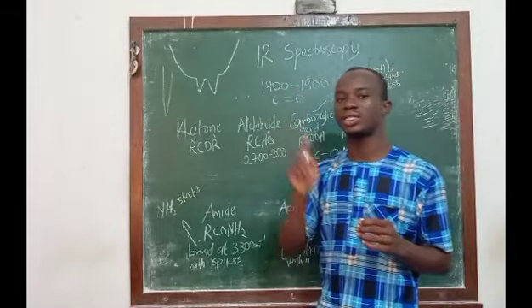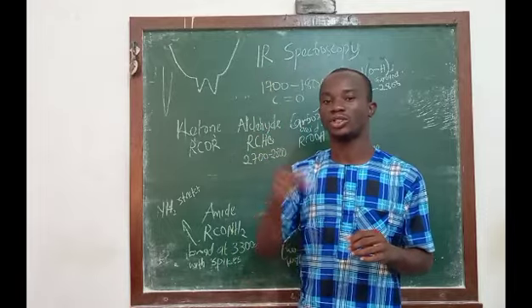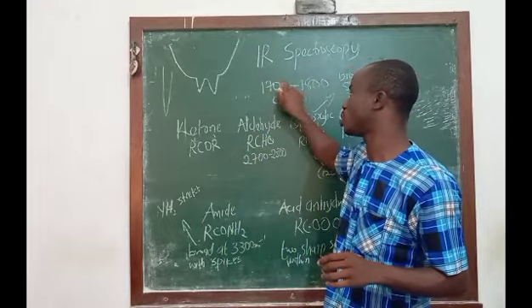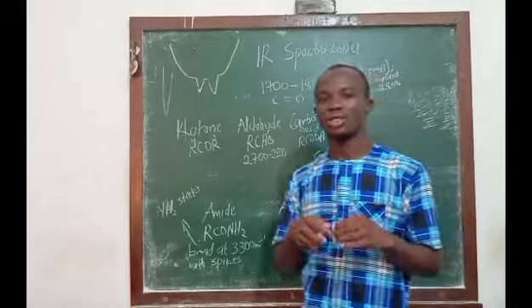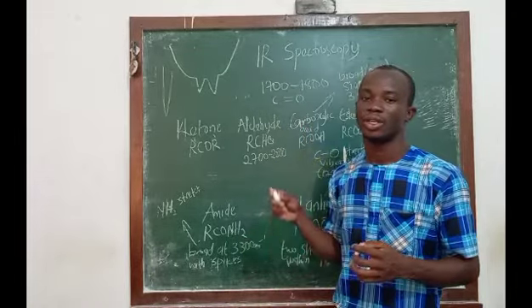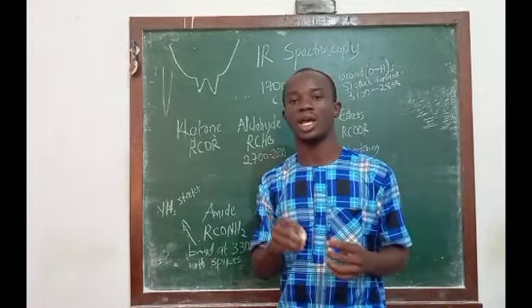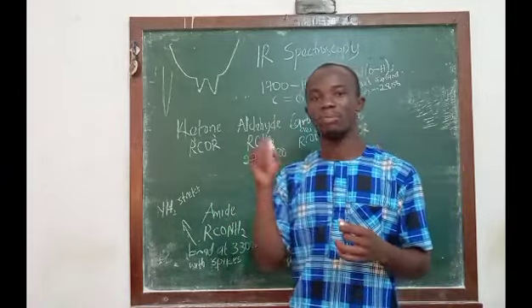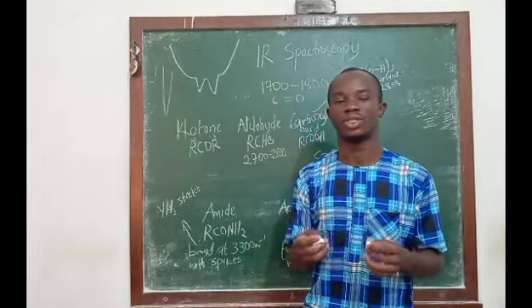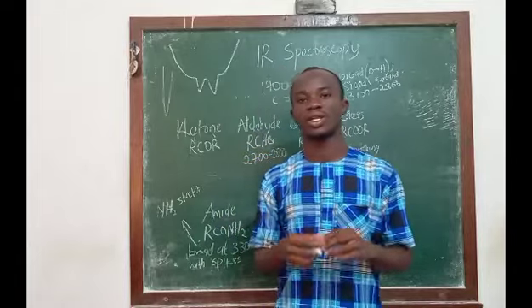And I also said that signals for carbonyl usually have an overtone, which is always found at 2 times the fundamental frequency for the carbonyl. And don't forget to always check for saturation or unsaturation in the carbonyl compound that the IR spectrum represents, by using some of the things that we have talked about in the previous lesson.